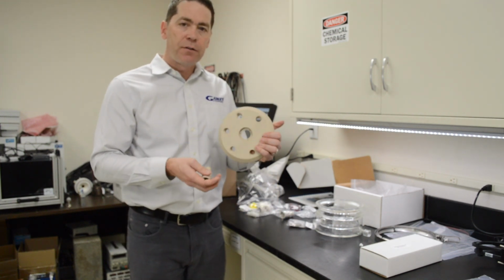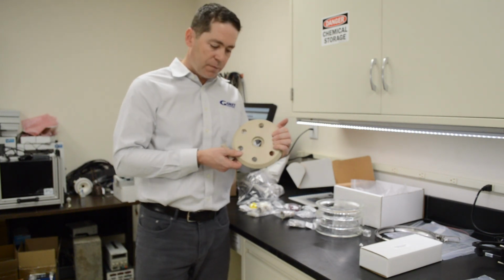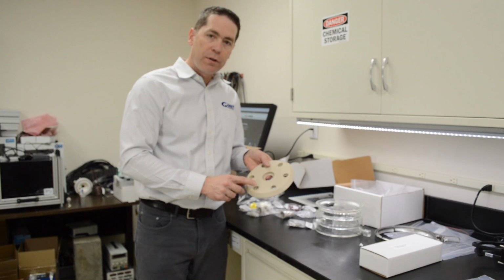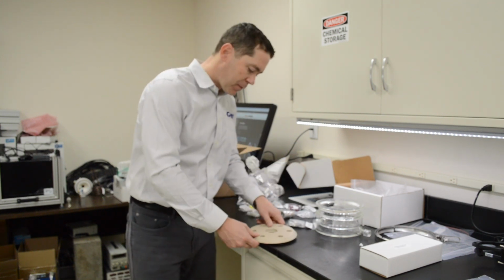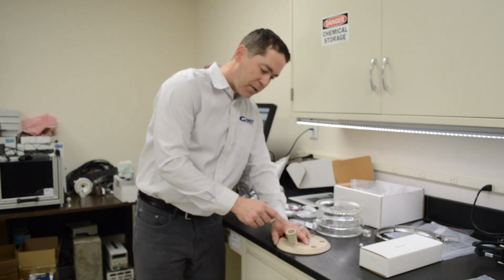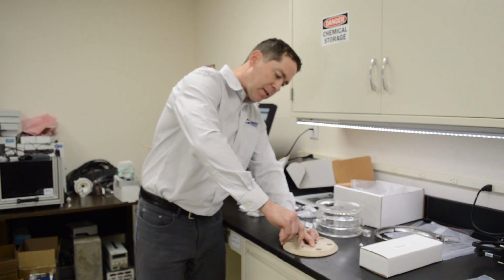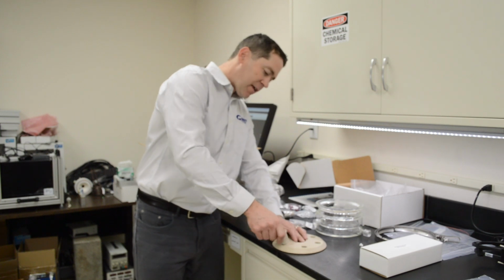So I want to show you how to mount one of these adapters or ports into the hole here in the PEEK. You have to make sure that the threads of the adapter are lined up well with the hole, or else they won't thread in all the way. So one of the tricks is you get it lined up and you press with your index finger to make sure that you're pressing the threads together, and then it makes it real easy to screw the adapter in. It's nice and easy that way.